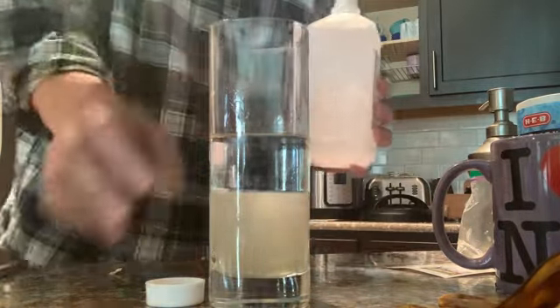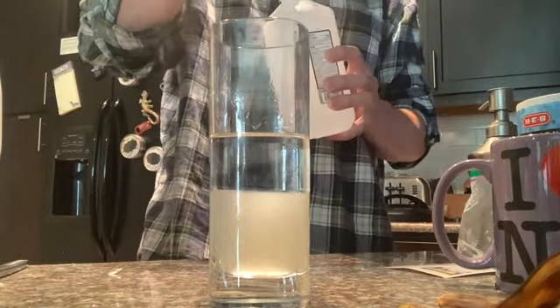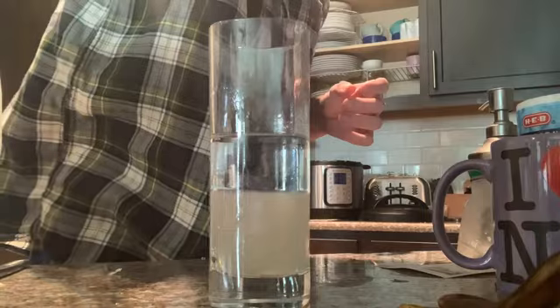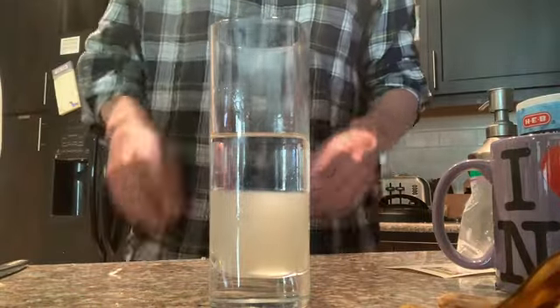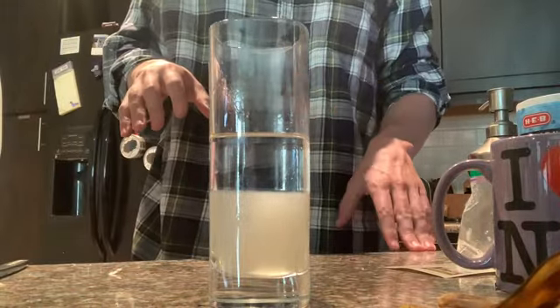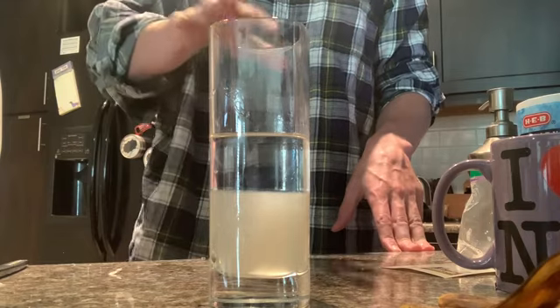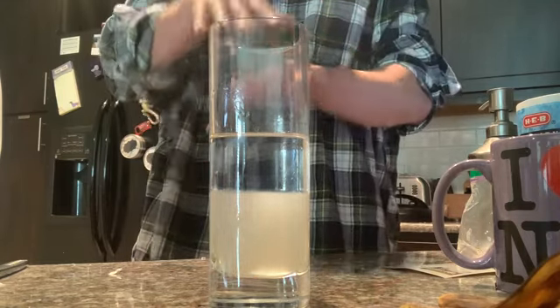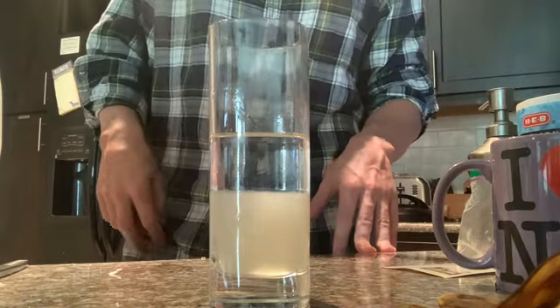The reason we get that is because alcohol is actually less dense than the water beneath it, so it floats on the surface. You can see this too if you ever see a little bit of oil and water underneath the car. You get that kind of rainbow appearance. That's because the alcohol or the oil on top is sitting on top of the water, and it refracts that light, so it's very pretty.